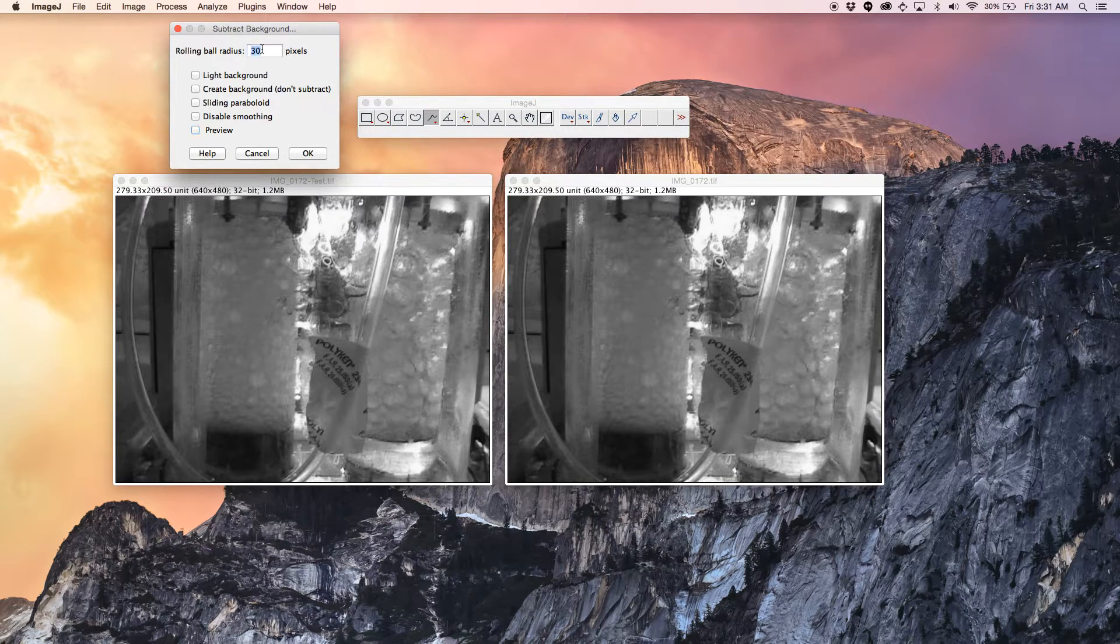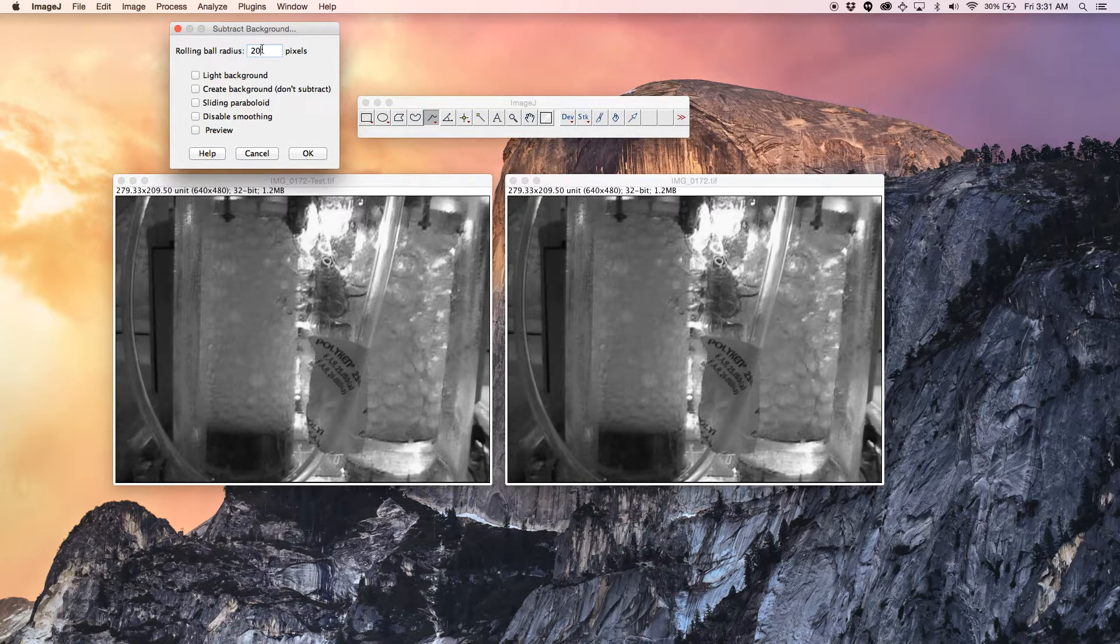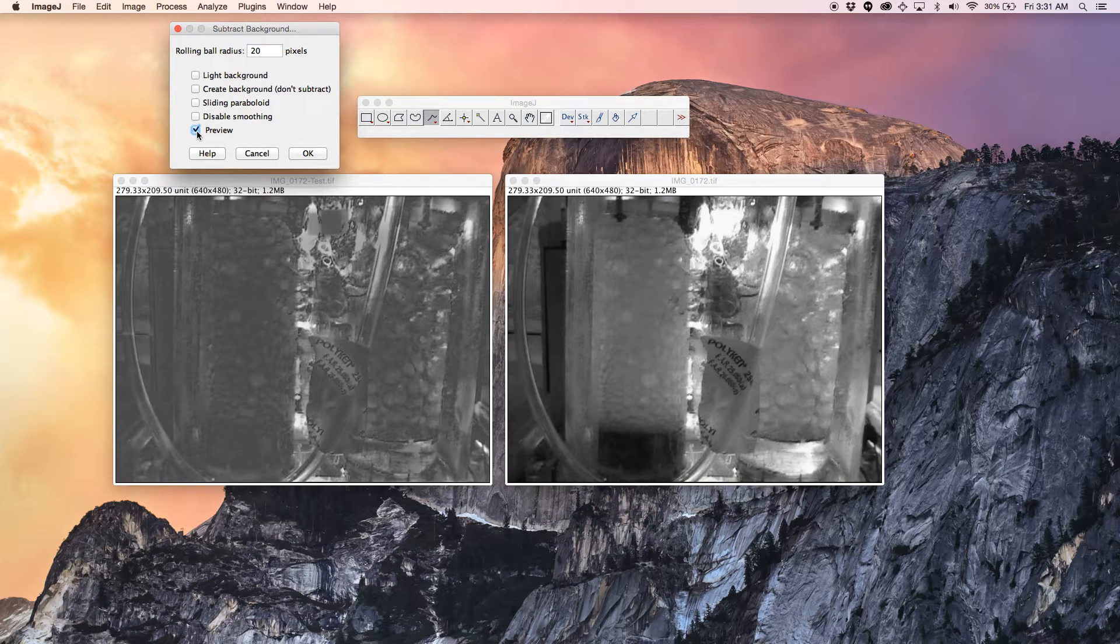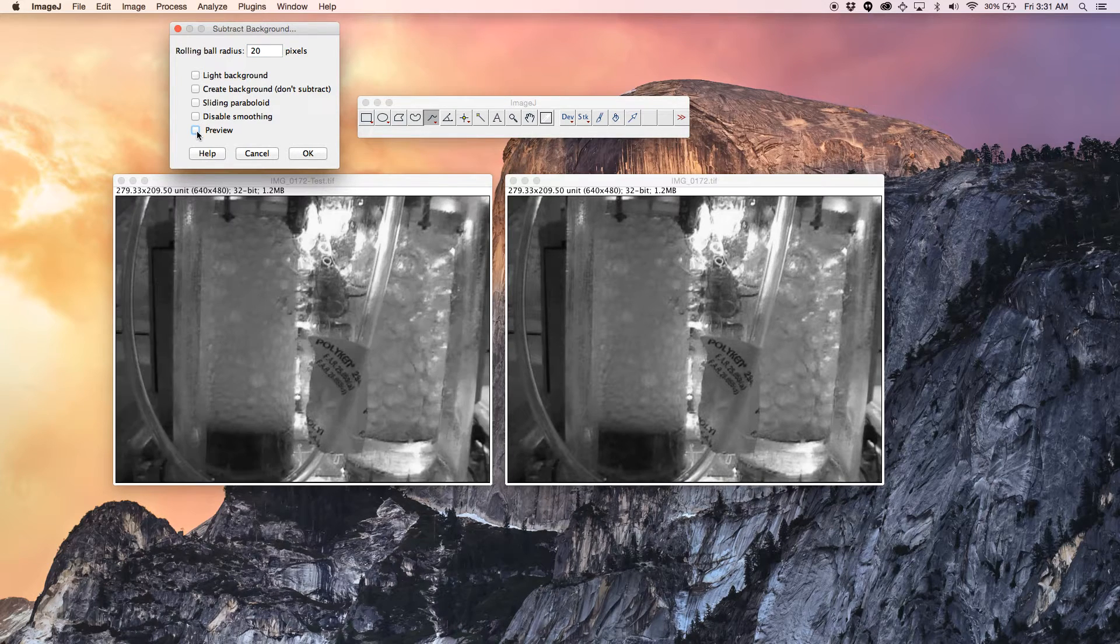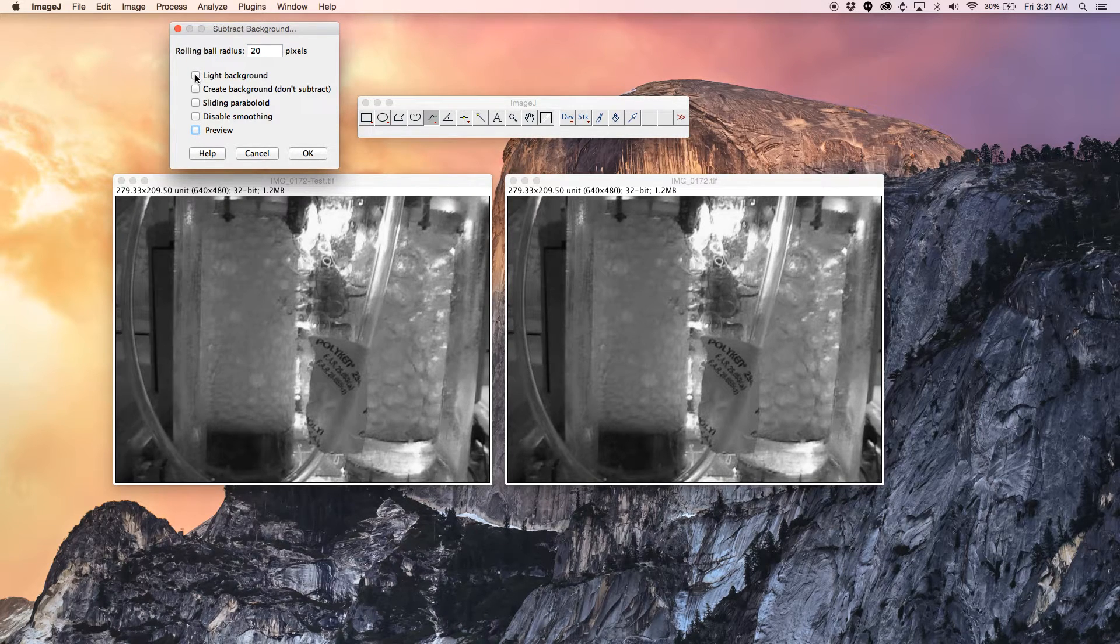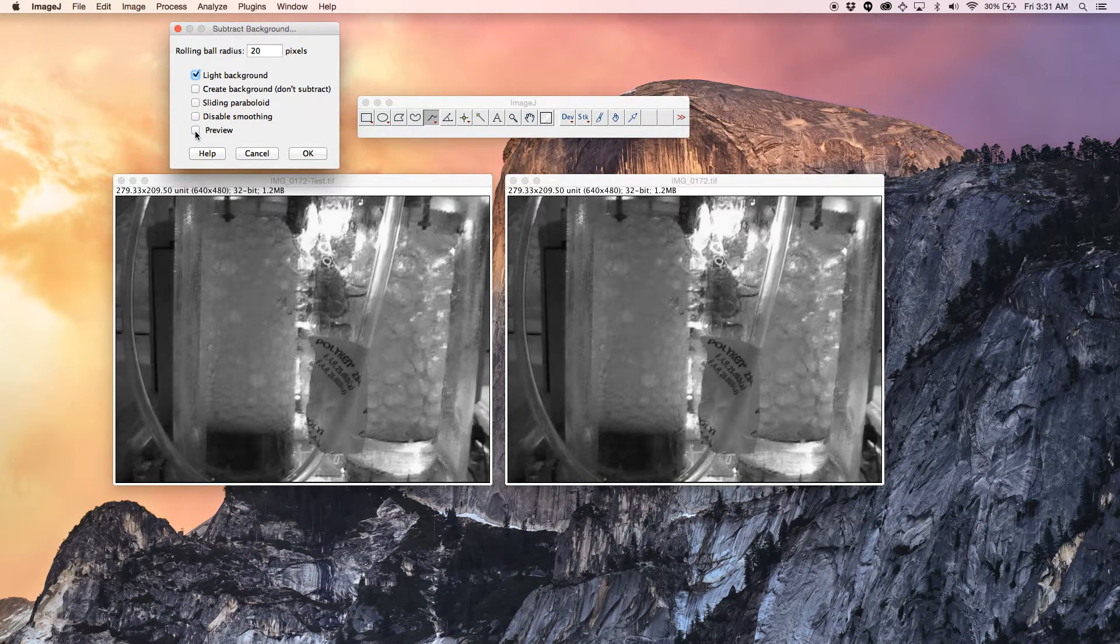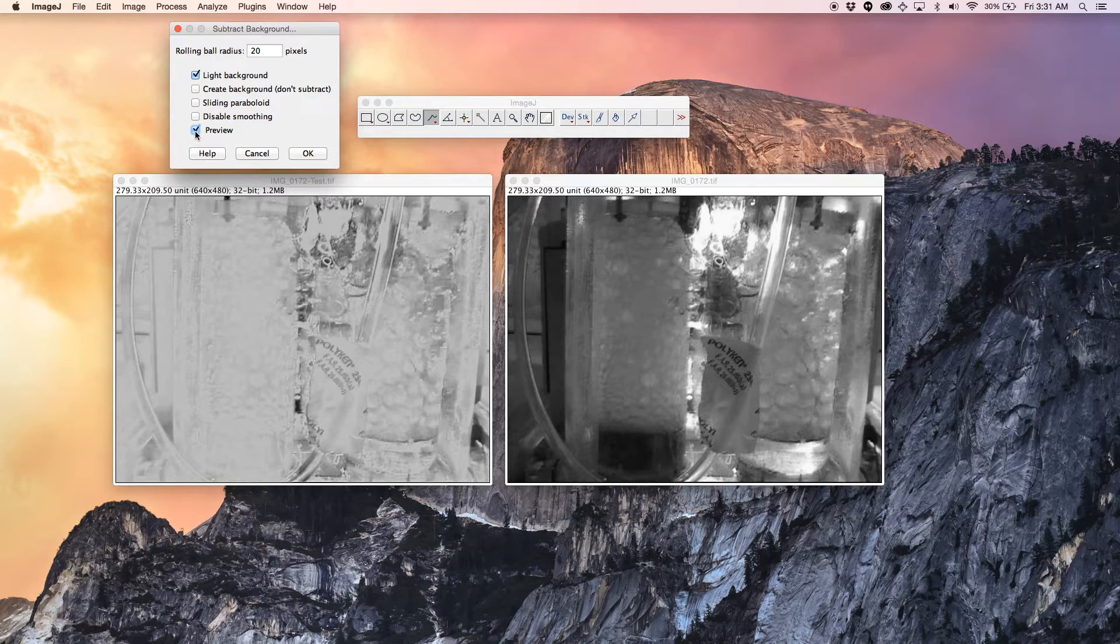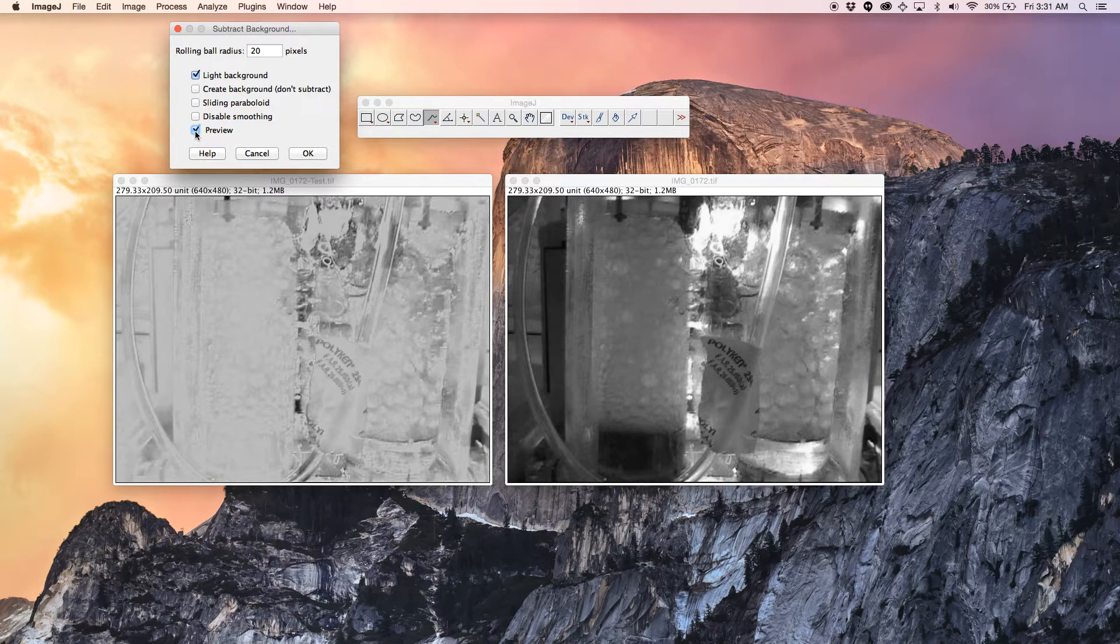Let's see another value. 20 and preview. And also it has light background. You can select that one and do that too, but it's not going to help for this image.